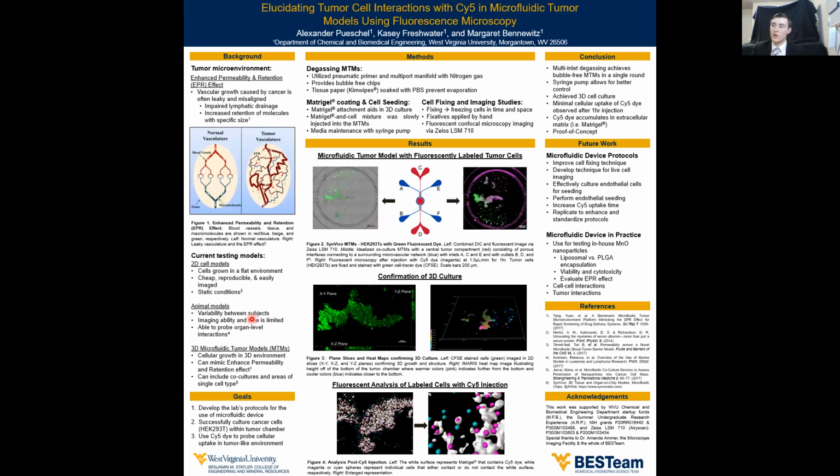Finally, we want to put these into practice. We want to use them to test our in-house MNO nanoparticles to see if the liposome encapsulation or the PLGA has an edge over the other and what other characteristics they have. Also, we want to have viability and cytotoxicity to see if the nanoparticles are killing cells. And finally, we want to see the tumoral interactions. How is it interacting with itself and other cells?